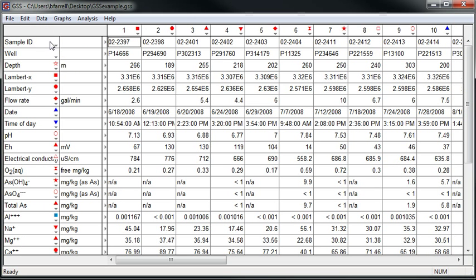To get started, I've opened up our GSS spreadsheet in which we've stored analyses for a number of samples.